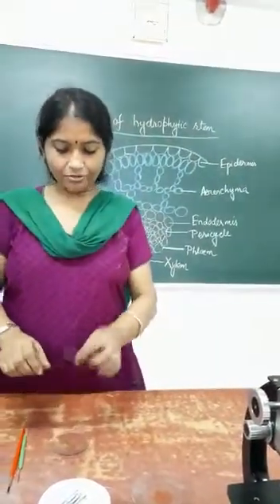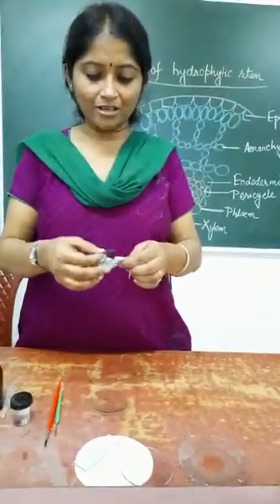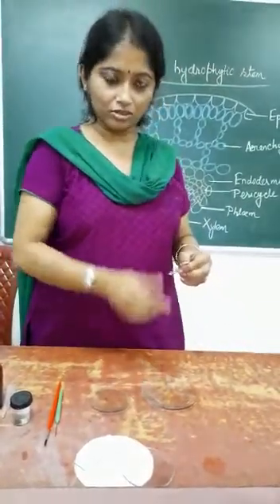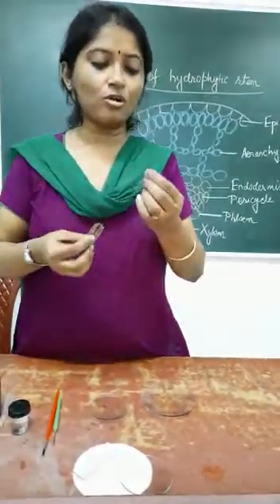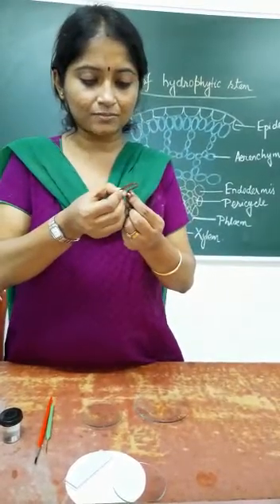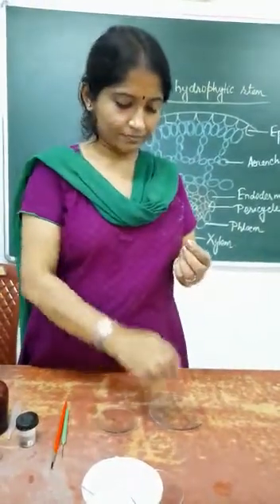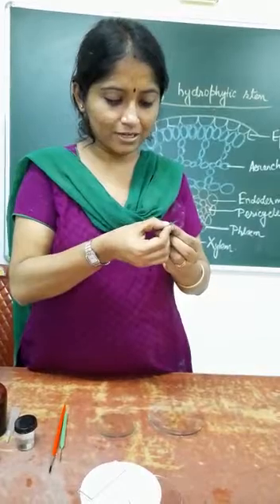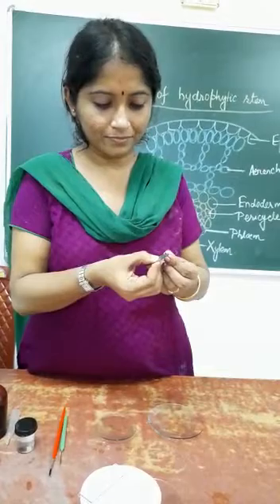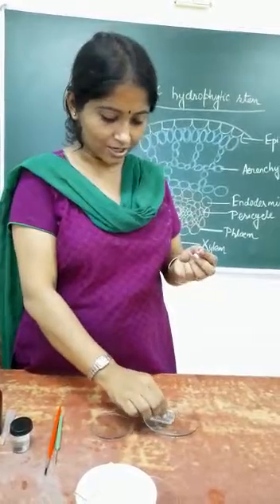Here I have taken the hydrophytic stem. Using a sharp blade I shall make some transverse sections of the stem. In another watch glass I have taken water. We are supposed to hold the stem vertically and make thin sections. By holding the stem vertically I am making thin sections of the stem.